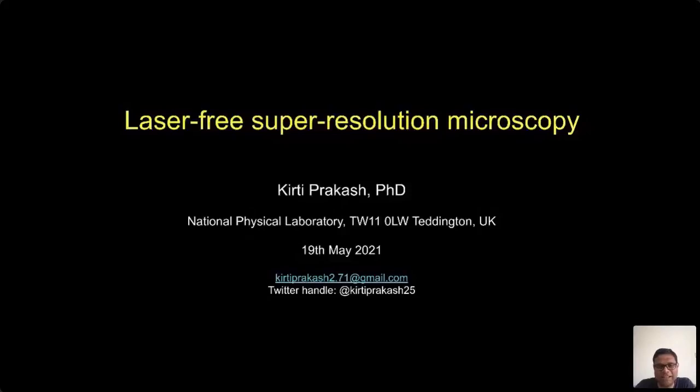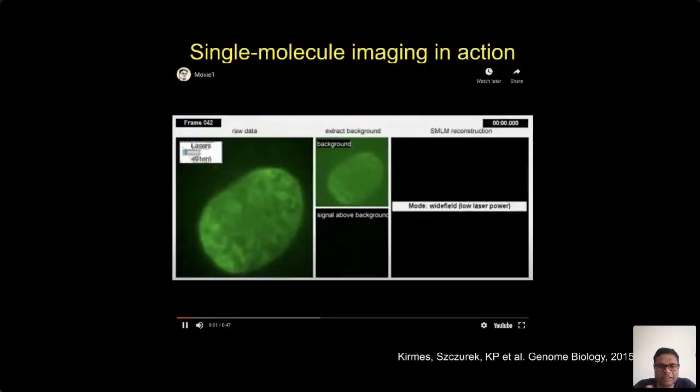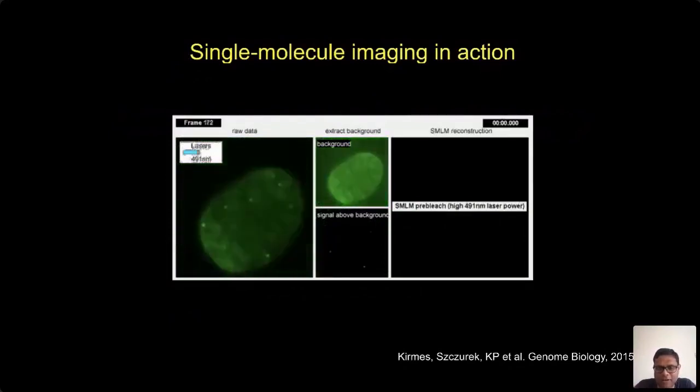Yeah, so I will just get started. One of the first things, so this is like how to do super resolution with some epifluorescence setup that you have in-house. So the first thing is, what is single molecule imaging? I'm not sure how many single molecule talks we had.